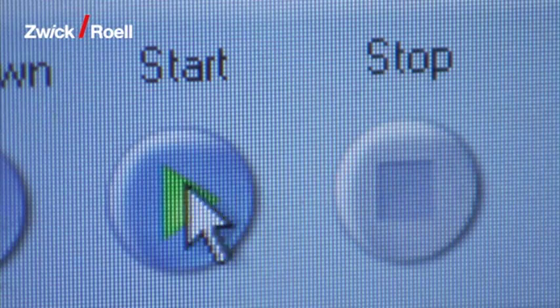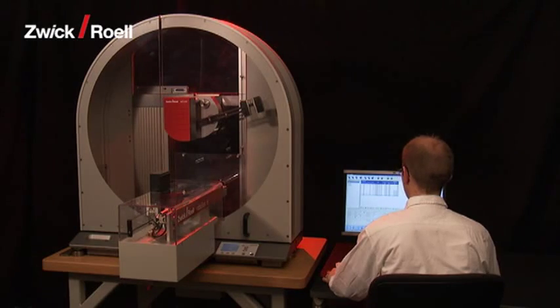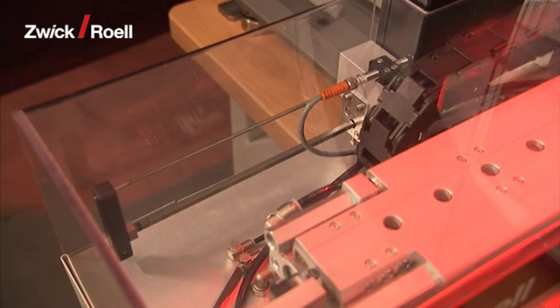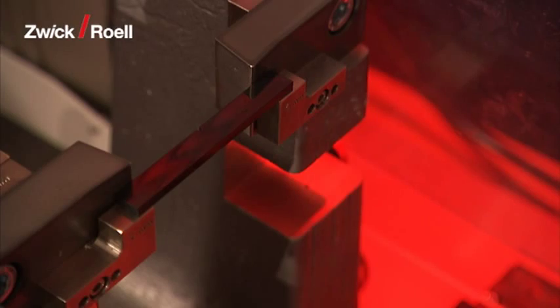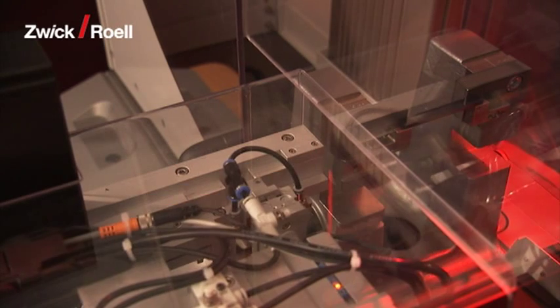The next step is to start the system in automatic mode via a button on the operating interface. The first specimen is pushed out of the magazine, transported to the support, centered, and the test is initiated. This all takes place within the prescribed five seconds.